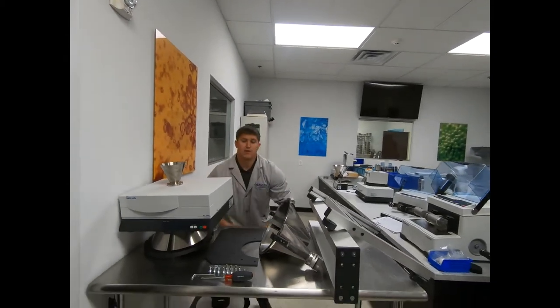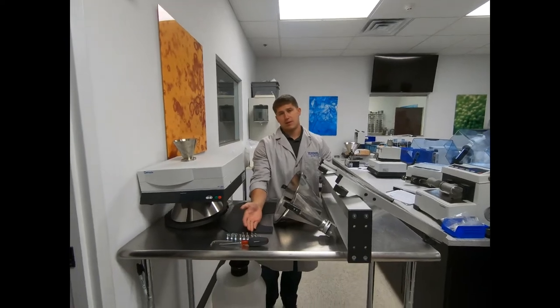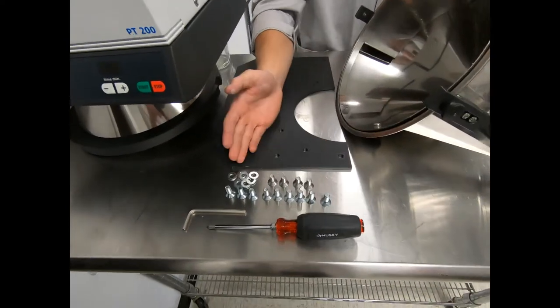You're also going to have your corresponding nuts and bolts along with a Phillips head screwdriver and your handy allen key.